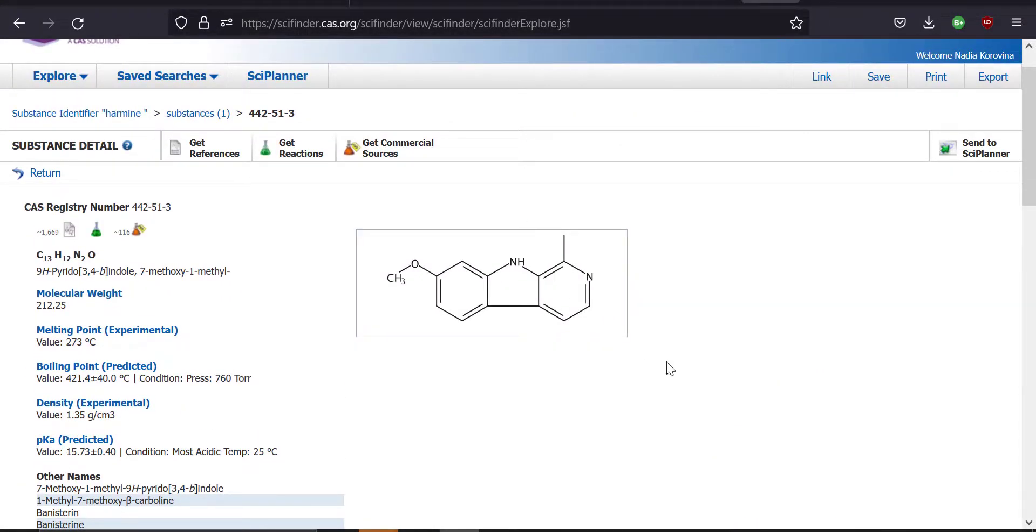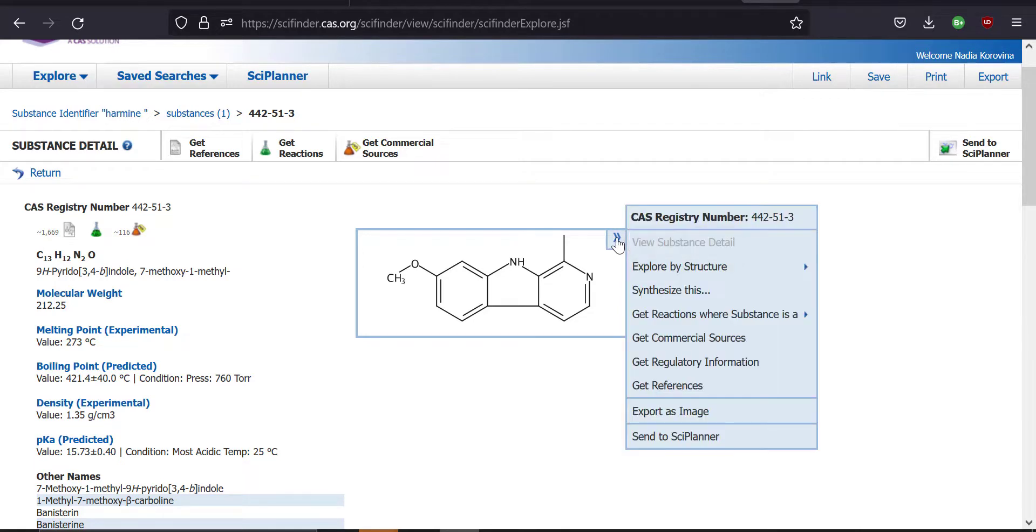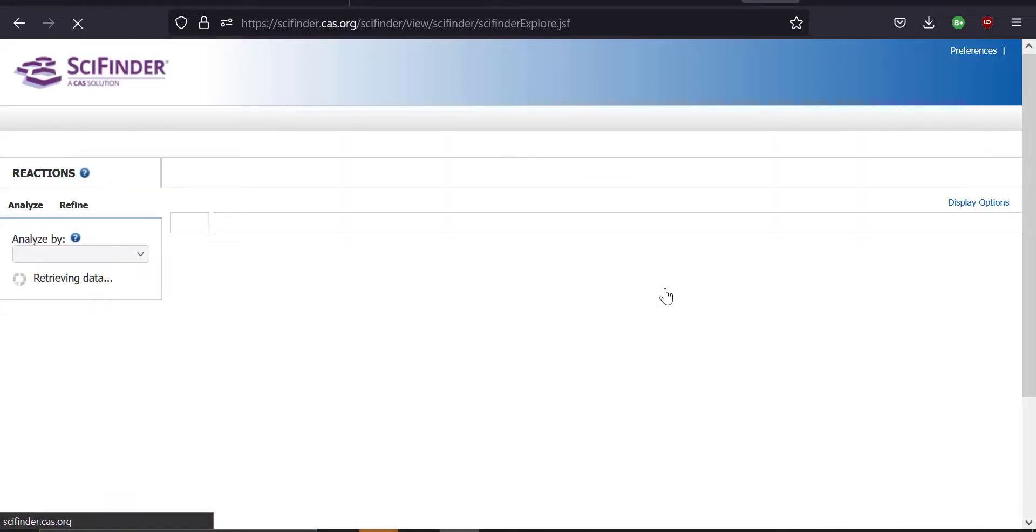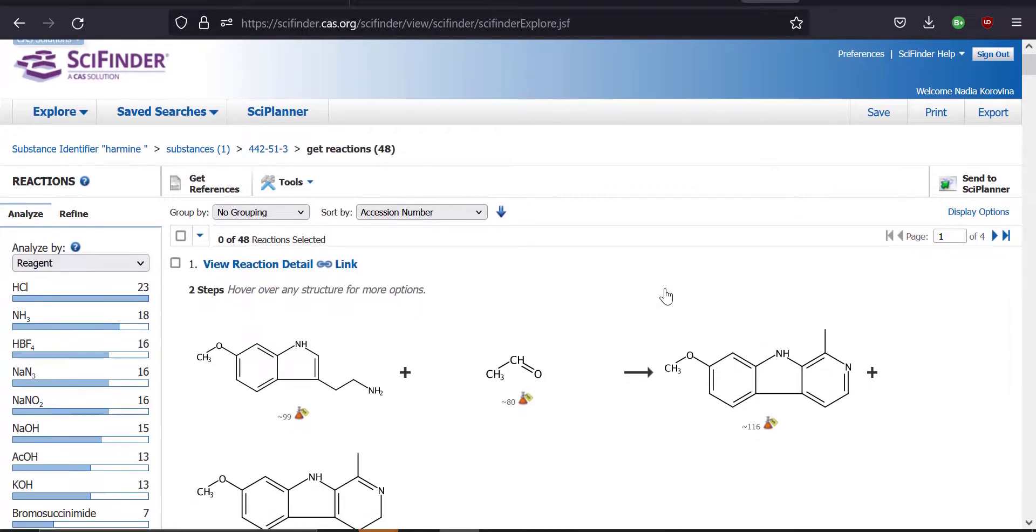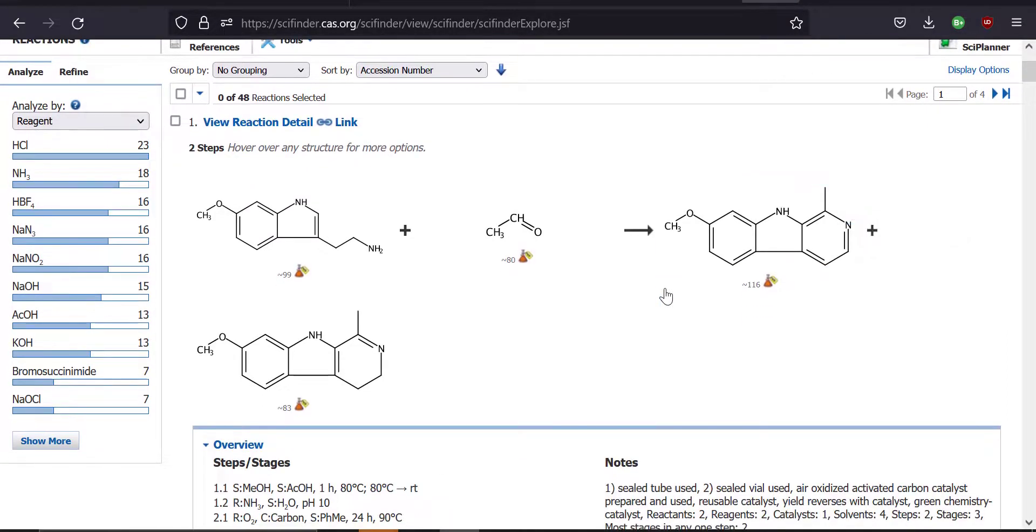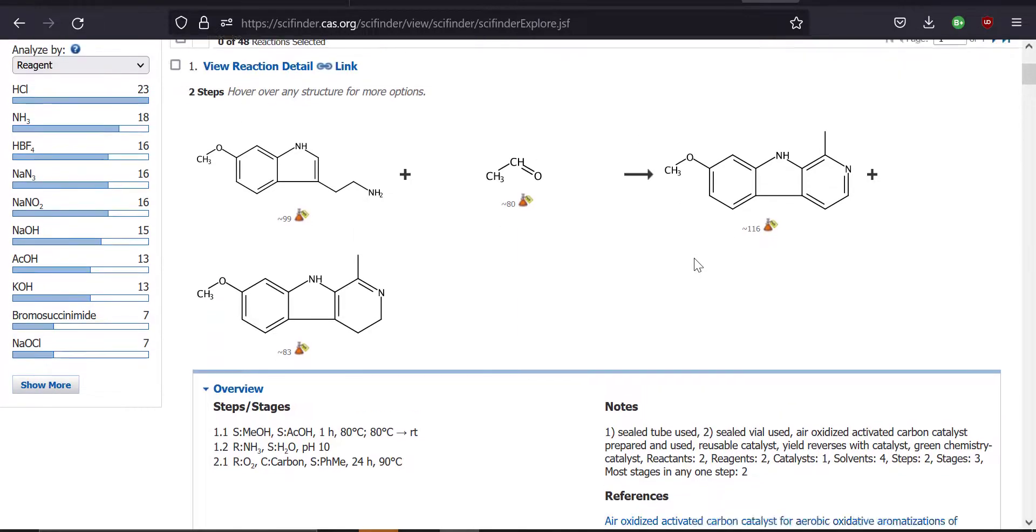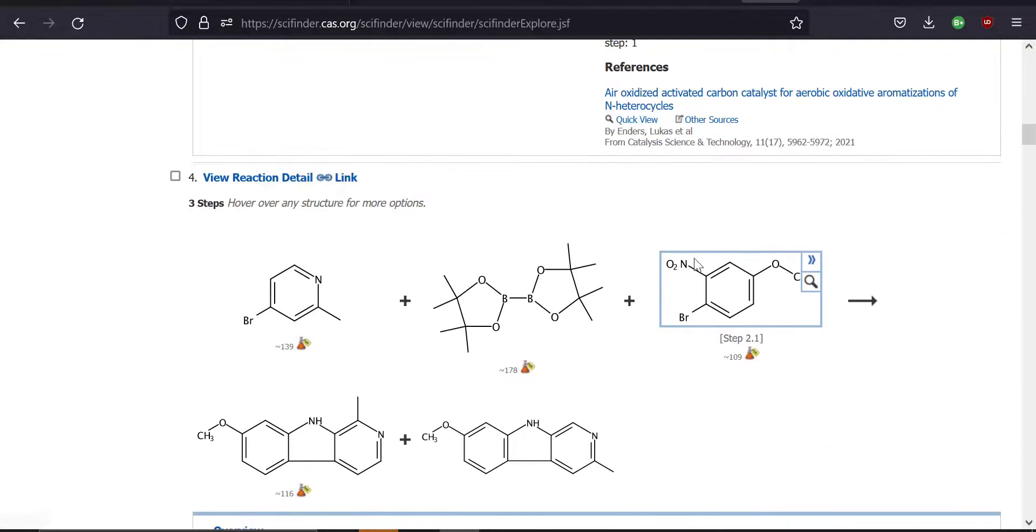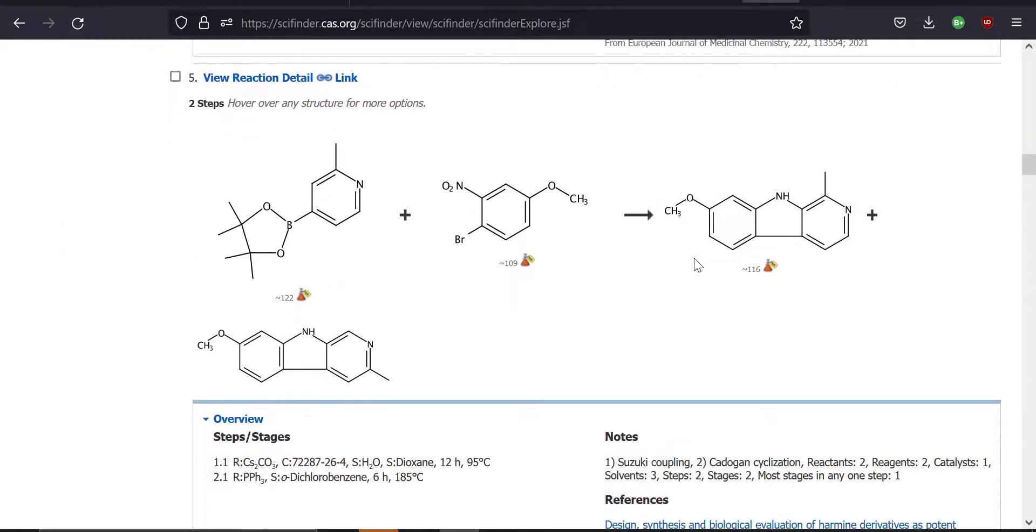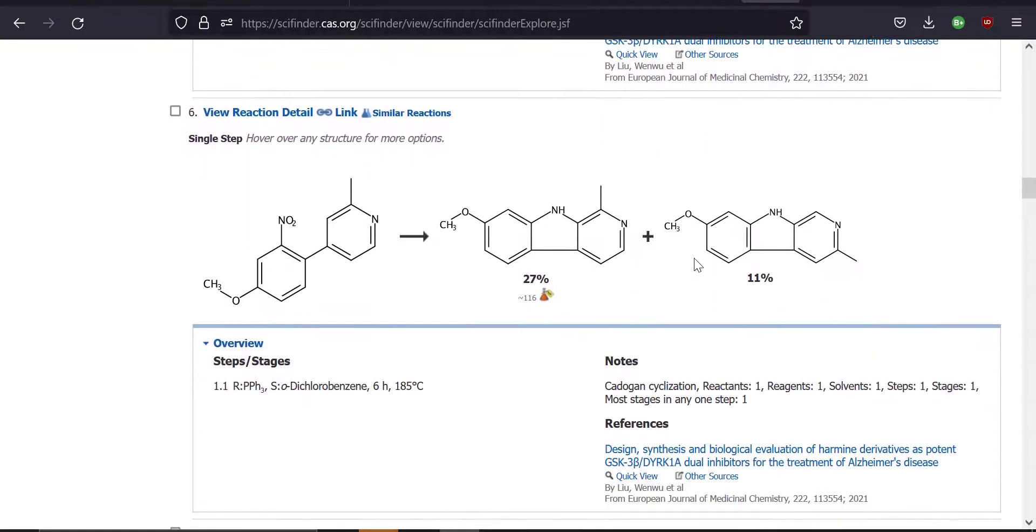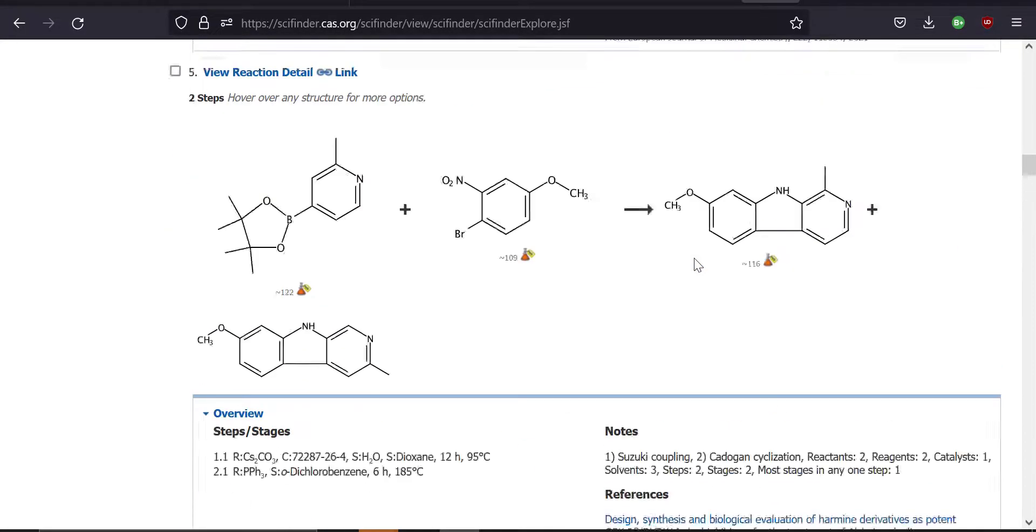One easy way to find that information is to just hover over the molecule here, find these two arrows here, click on the arrows and click on synthesize this. This will show you a list of various ways in which people have synthesized harmine. Notice that there are a lot of options for how to synthesize this molecule. So you can narrow it down by various options.